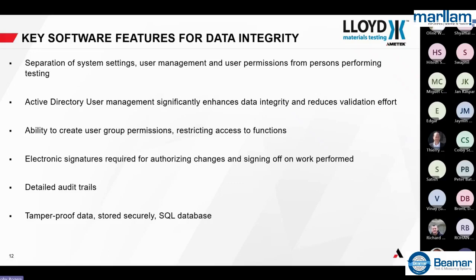A critical part of 21 CFR Part 11 is to make sure that the manager of the system, who can add and remove users and decide what permission levels people have, are not the same people as those performing the tests. Again, we're looking at data integrity. And if those performing the tests have access to the user management and permissions, then it's a challenge to be able to believe in the data. So we'll see later that the Nexigen Plus software has features in there to ensure that we separate these features.